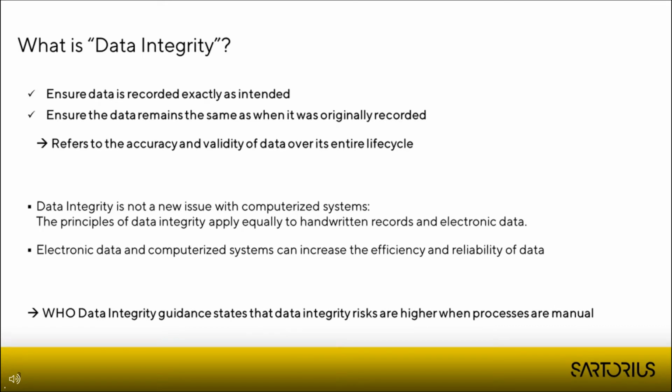So what is data integrity exactly? With data integrity, we want to cover two major goals. One is to ensure that the data is recorded exactly as intended, maybe when we transfer a value from the instrument to our laboratory system, like in LIMS or ELN. And on the other hand, we want to ensure that the data remains the same as when it was originally recorded over its entire life cycle, which can be in the pharmaceutical industries more than 20 years.